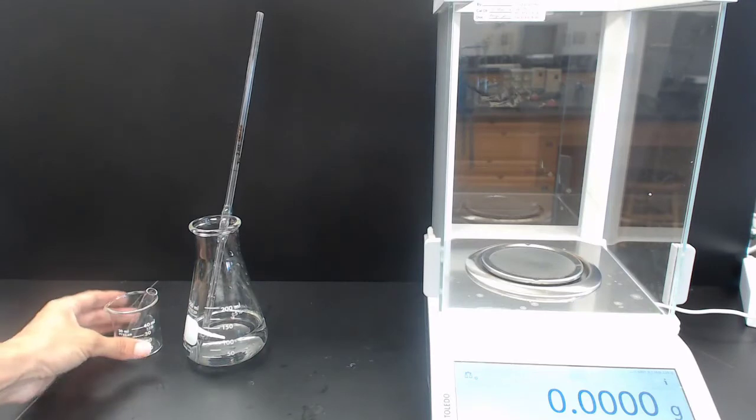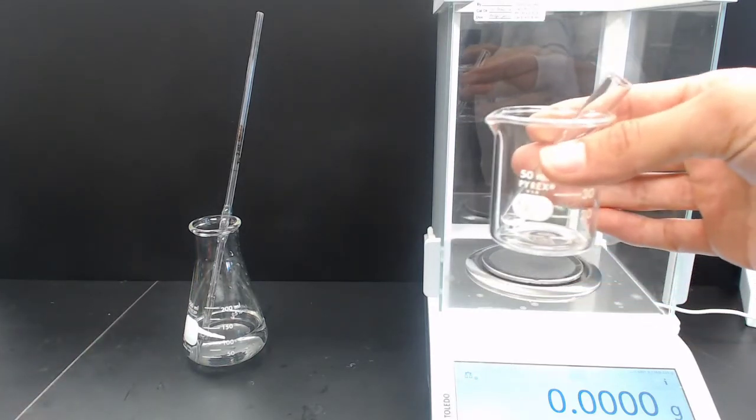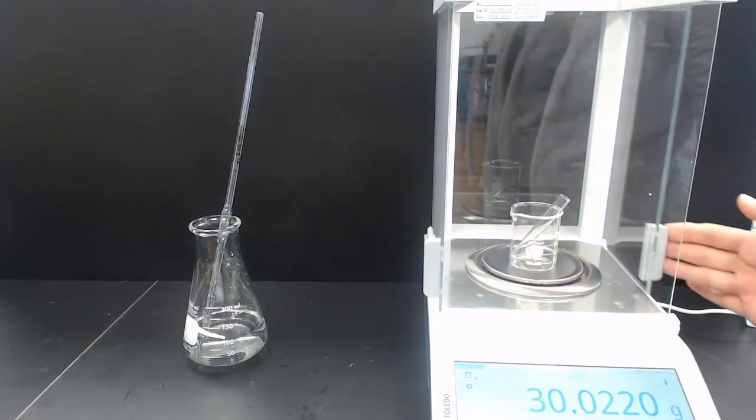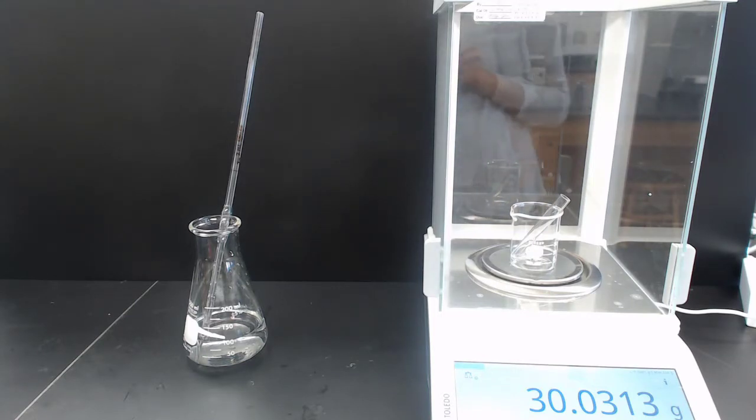So what the lab has us do for mass is to take a small 50 milliliter beaker with a small test tube, and we'll get the mass of the empty test tube and beaker. We will record this mass as we see it using all of the digits from the scale as the mass of test tube and beaker for trial 1. Then we will be pipetting 2 milliliters of water.